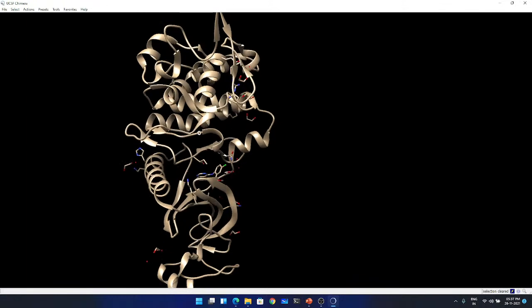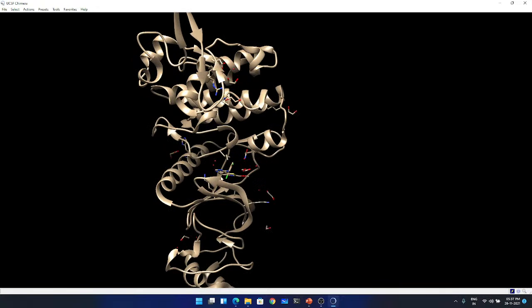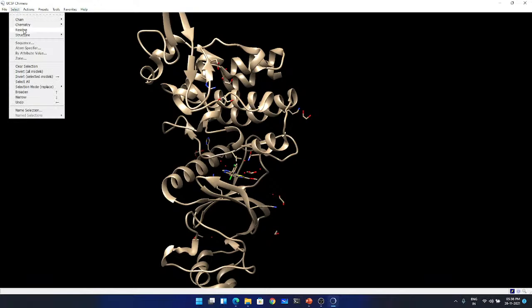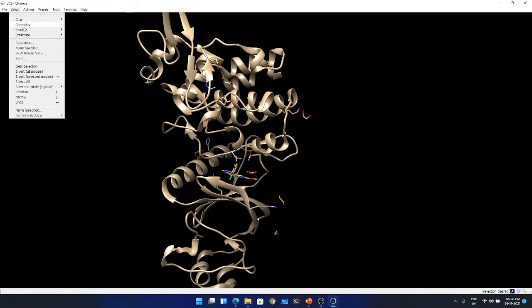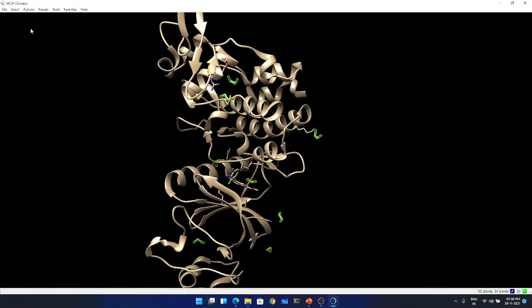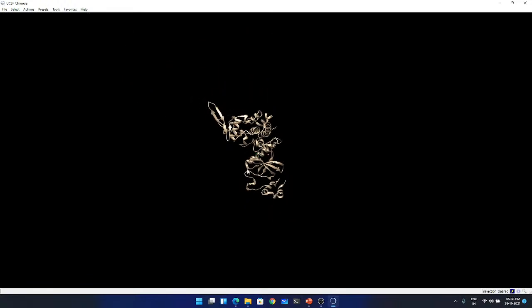Now this chain contains a lot of other things, like many other ligands, one co-crystallized ligand, lots of water molecules, and there are no hydrogens. So we need to do some basic preparation here. To perform that, I will go to Select, Residues, and I will select the residues like water molecules. Again, delete them. There are some simple options as well, but just to show you step by step, I am going one by one. Then we have these ethanediol molecules in the protein. I'm going to delete them. Now we are left with the protein and the ligand which is there in the binding site.